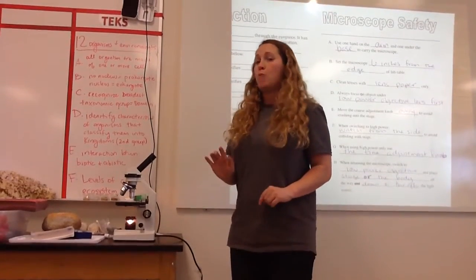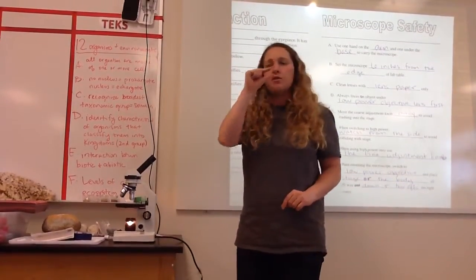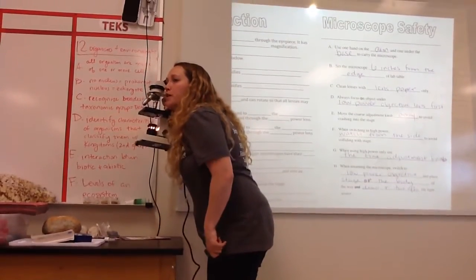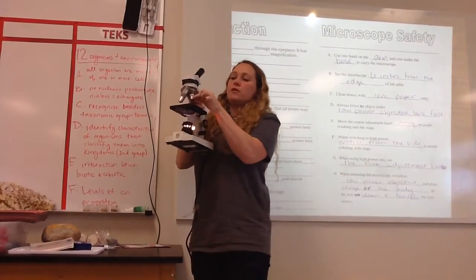Now I need to make sure I'm on low power. Low power is the short one. So you take the nose piece. I like to pretend the microscope's a face. The nose piece is right where your nose would be. Okay? So the nose piece swivels. Do you see that?